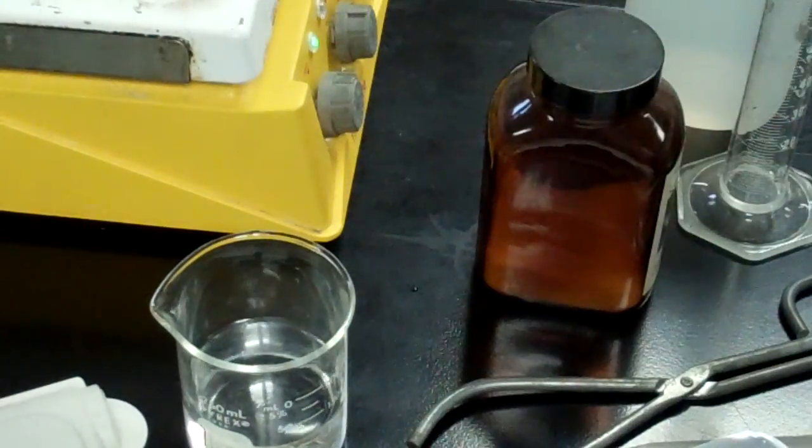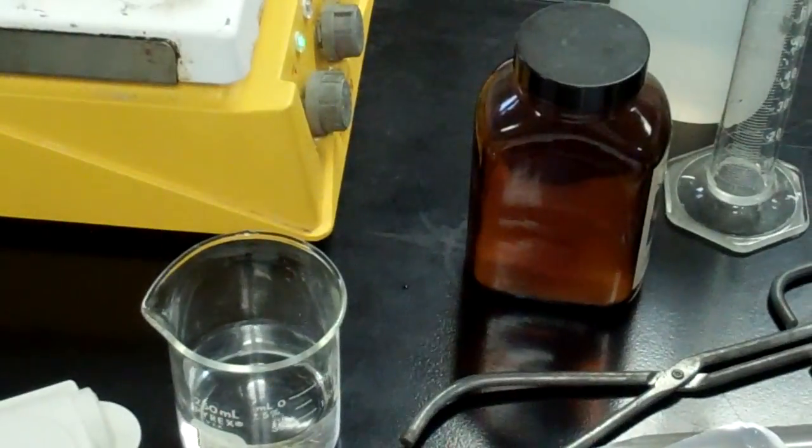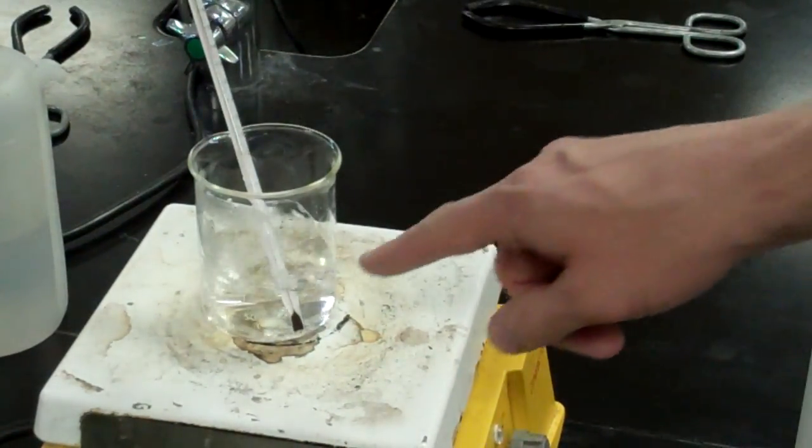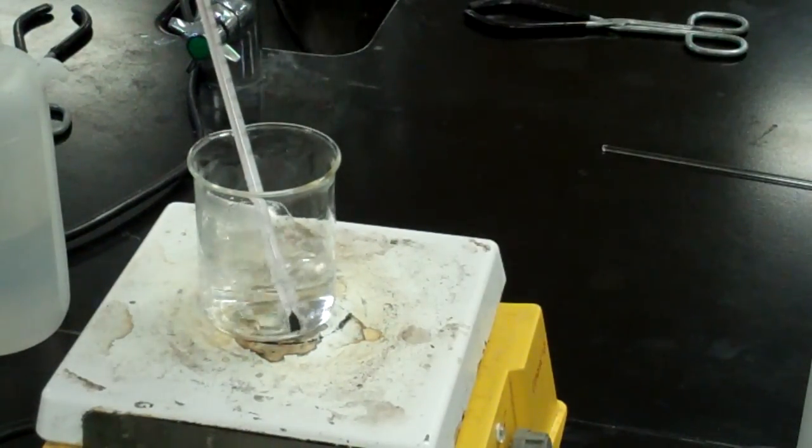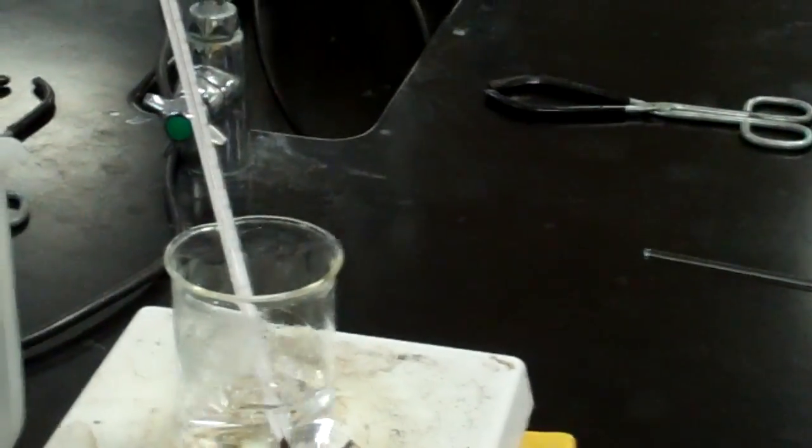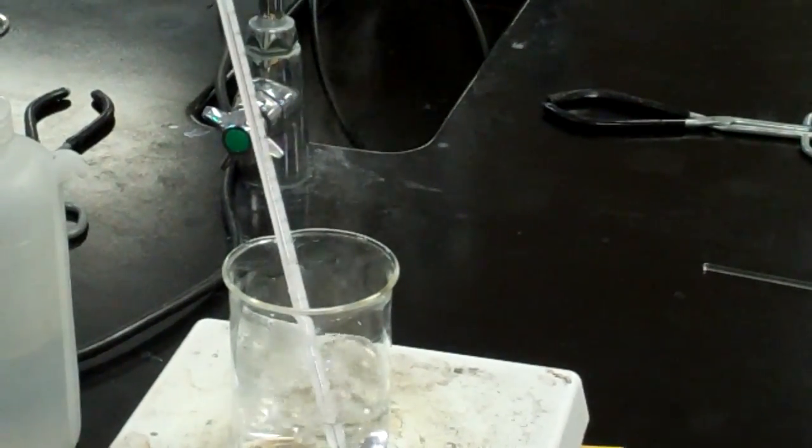Now you're going to measure that boiling point so you're just going to get your beaker with 100 grams of water in it. You'll allow it to come to a rolling boil and you'll measure that temperature. So let's zoom in here. I'm not sure if we'll be able to see it very well here but in fact we can't.